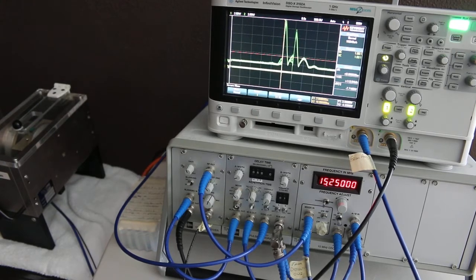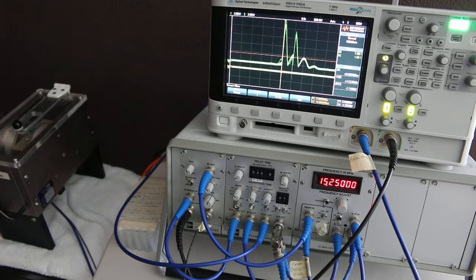Being a time domain experiment, the pulsed NMR, you sort of want to have careful control over when the RF is on the sample and when it's off. So you can watch time dynamics, say, in the cases when it's off.